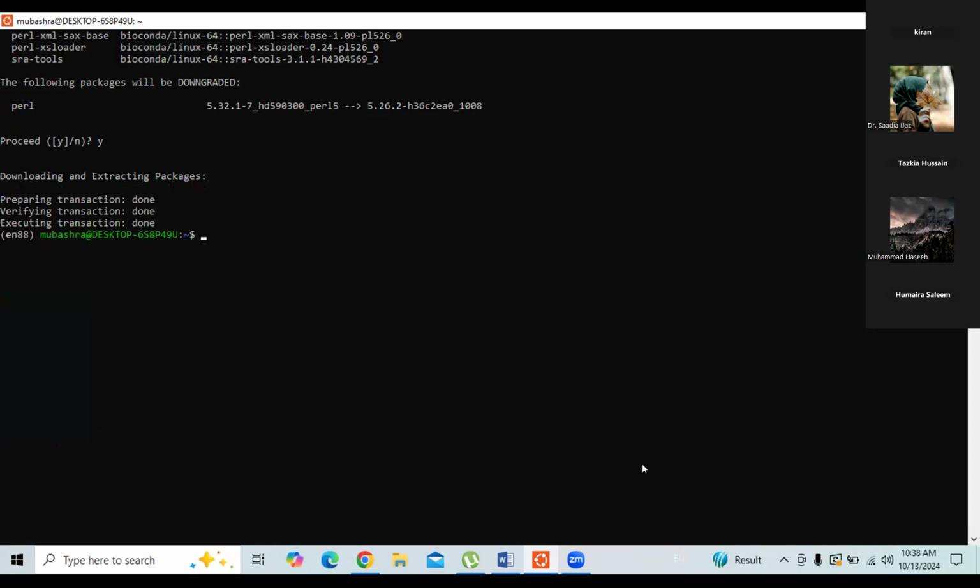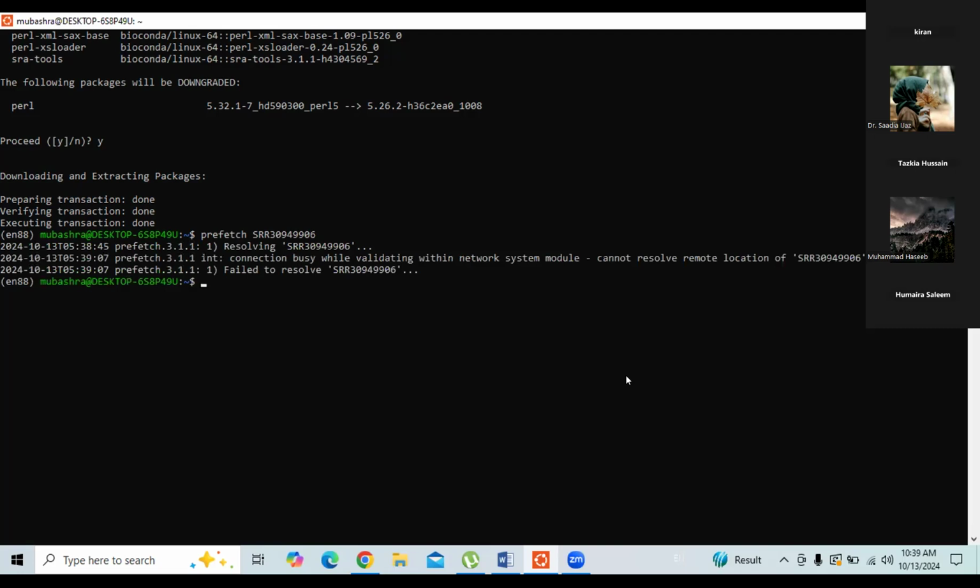Okay. Now try to run the prefetch command. Okay, the internet connection is unstable. Yeah, you have an unstable internet connection.